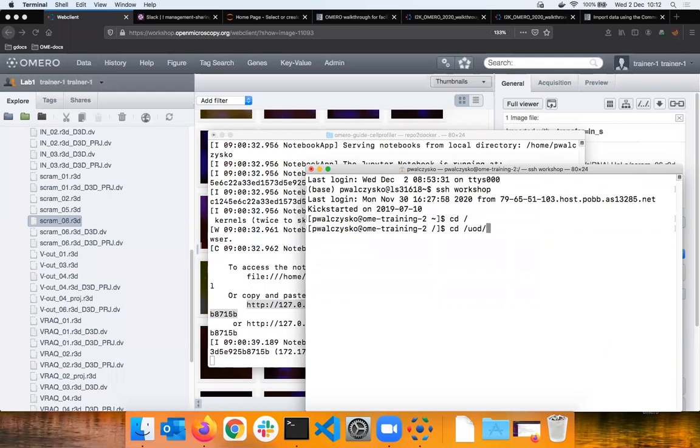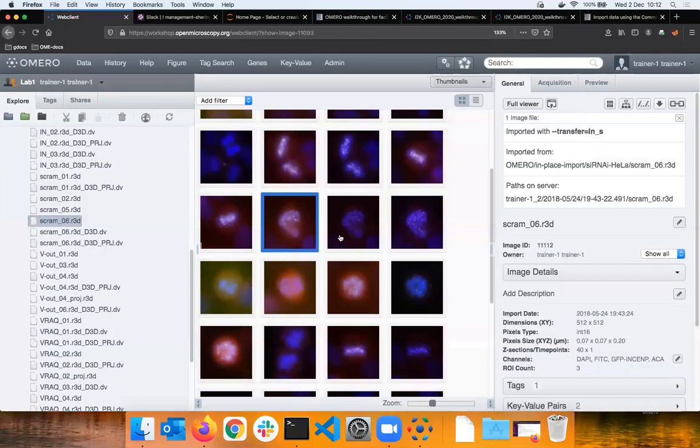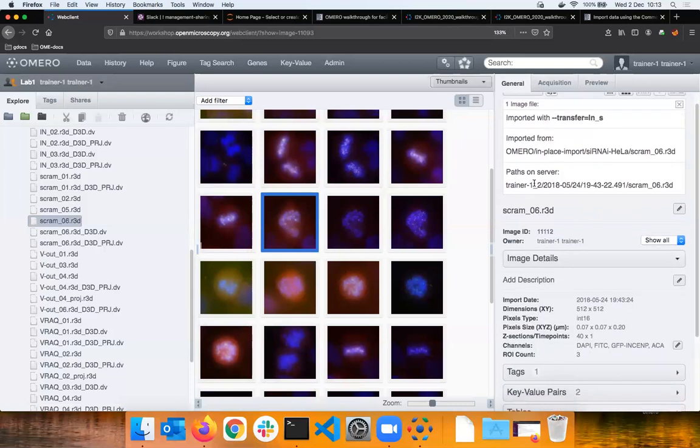One thing that Sylvie suggested: we have some examples, but we didn't publish them. Peter, can you remove your terminal and show in the web the in-place import, where you can see the path? In that case, there is the ability to update that path if the user changed it. I think we have some example scripts that we have used internally, but we have not published them. That's something we need to publish for others, because that could happen if the user is not careful, and a mechanism to reconcile the paths is needed.